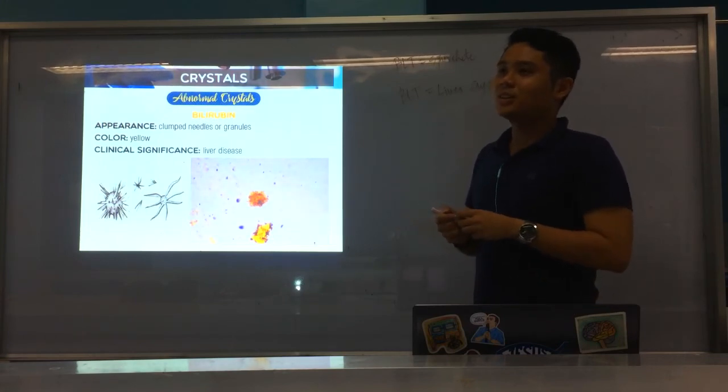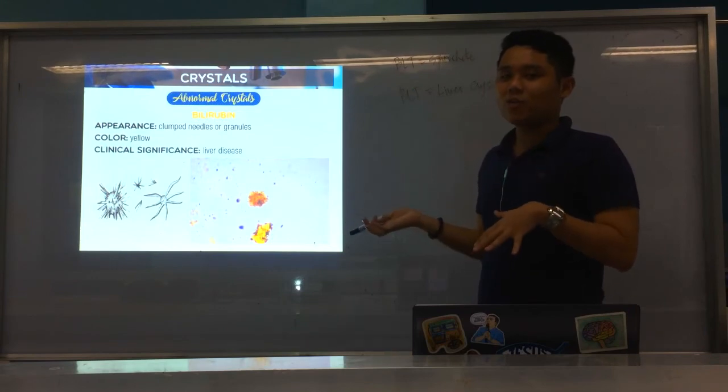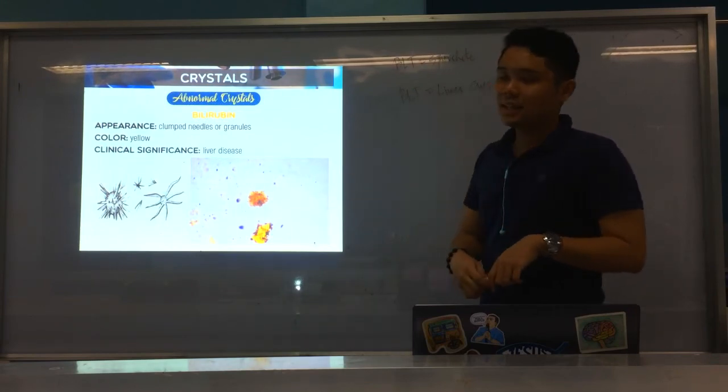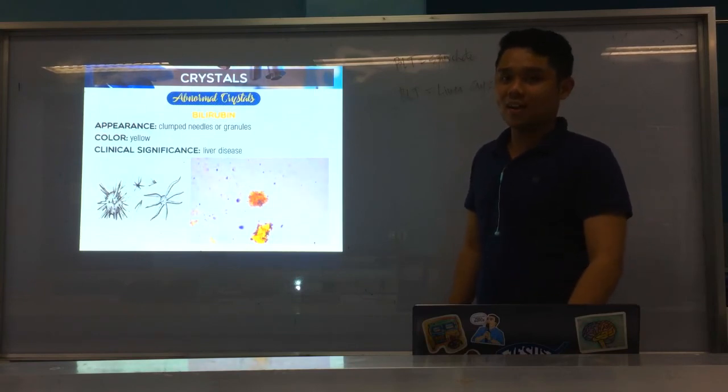Okay? Alright, please take note. Do not mix the two, okay? If BLT sa micro, the spirochetes. Kung sa CM, BLT are the crystals in liver disease. Okay?